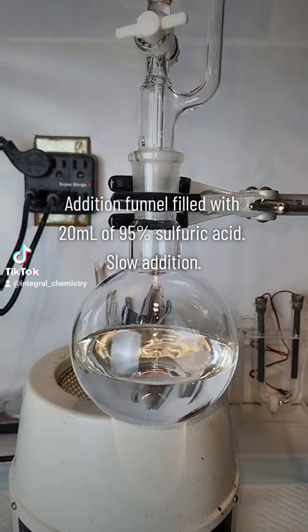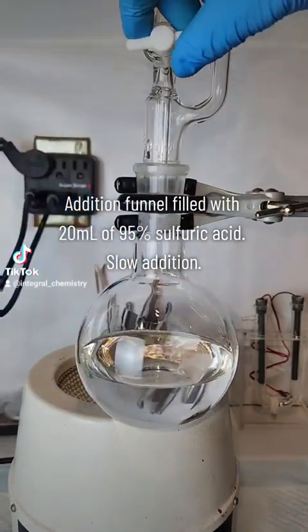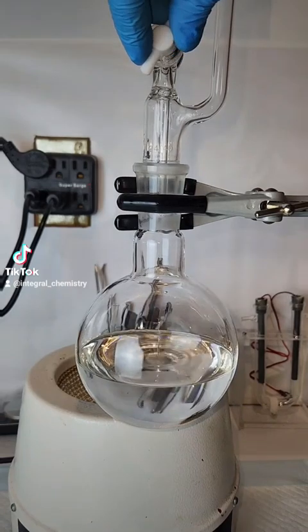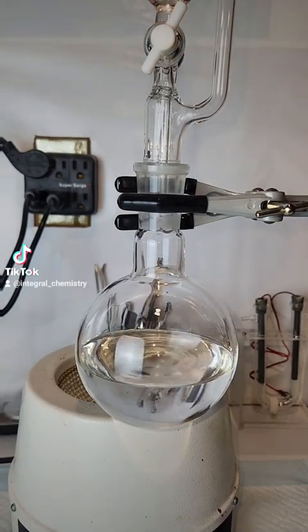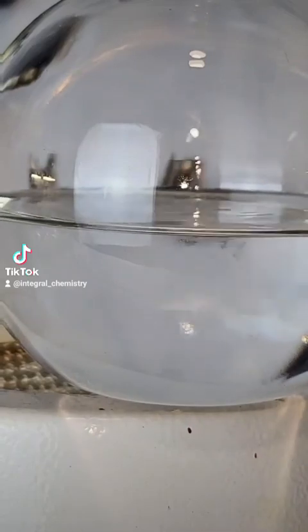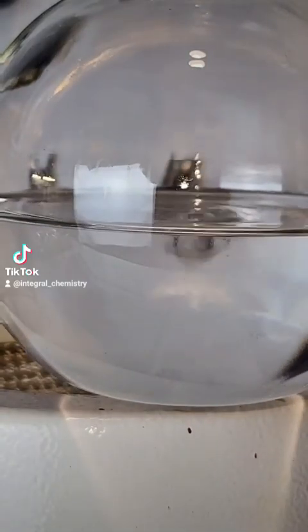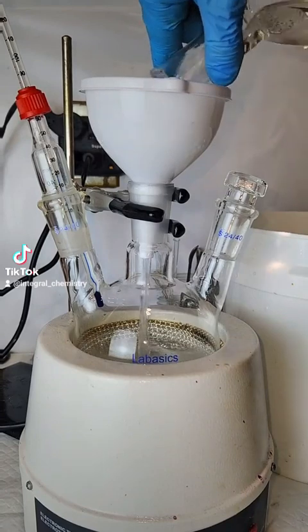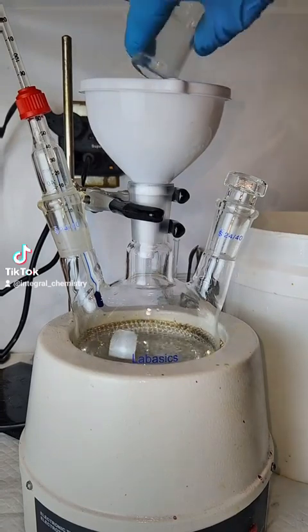To begin the synthesis, I add 100 ml of glacial acetic acid and 100 ml of anhydrous ethanol to a flask. I then attach an addition funnel filled with 20 ml of 95% sulfuric acid and add it drop-wise. The addition of sulfuric acid must be done slowly, as adding it too fast might cause the ethanol to boil away.